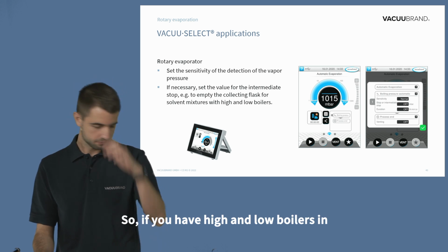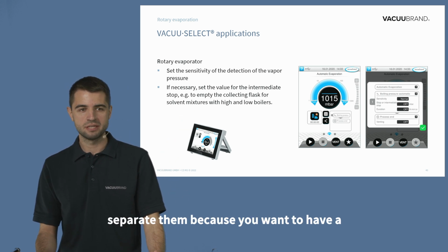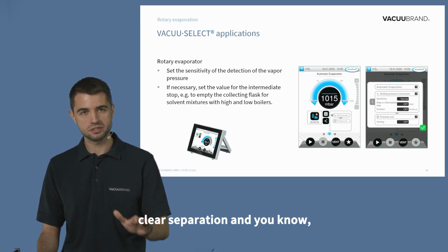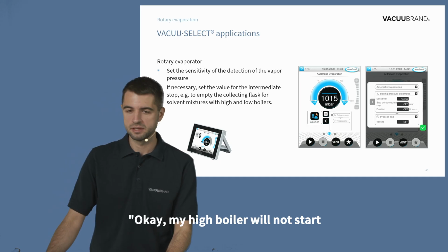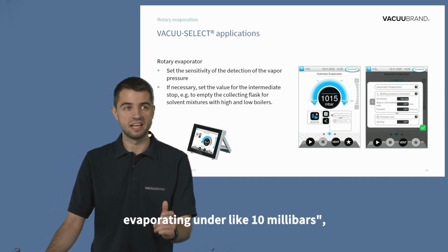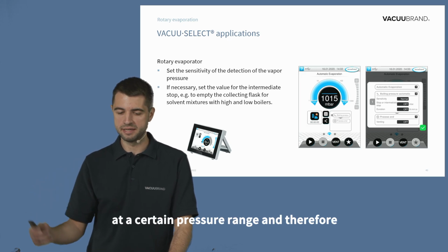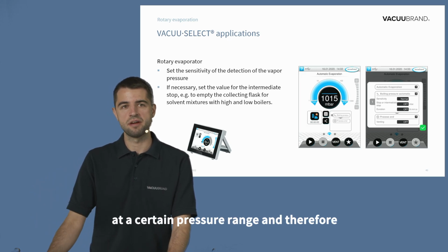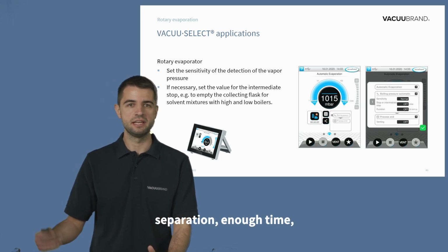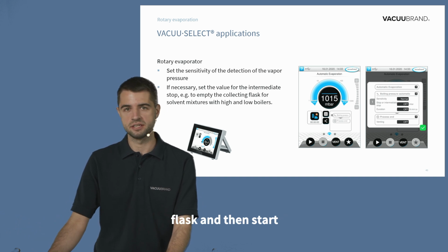So if you have high and low boilers in your evaporation flask and you want to separate them because you want a clear separation, and you know, okay, my high boiler will not start evaporating under like 10 millibars, then you can put this intermediate stop at a certain pressure range, and therefore have a clear cut, a clear separation, enough time because the pump will stop to change the flask and then start the process from new.